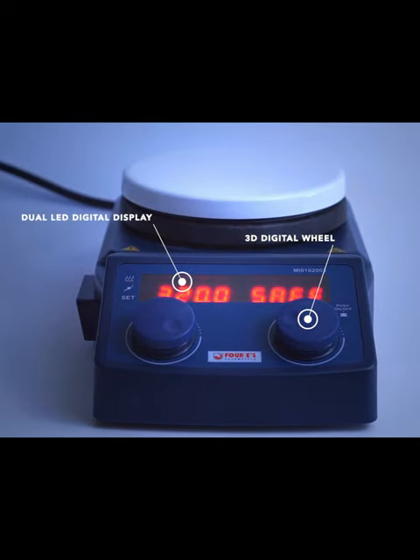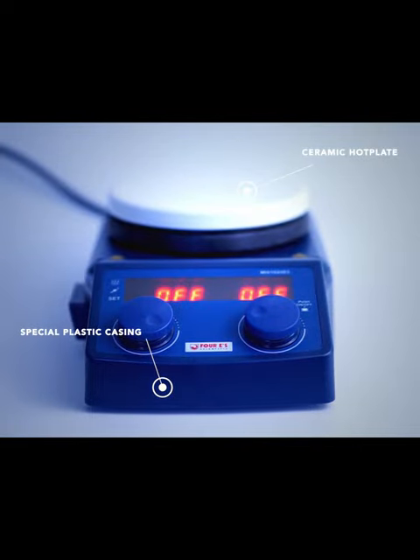There are dual LED digital displays and 3D digital wheels. The machine comes with special plastic casing and a ceramic hot plate.